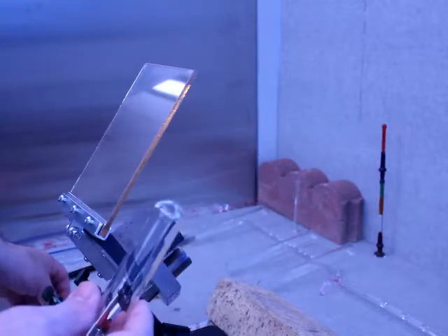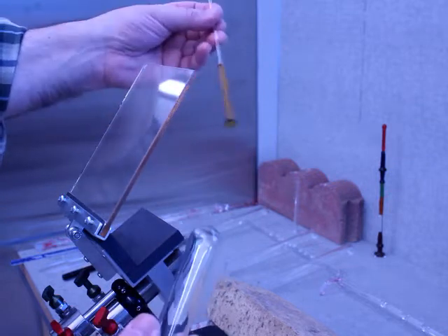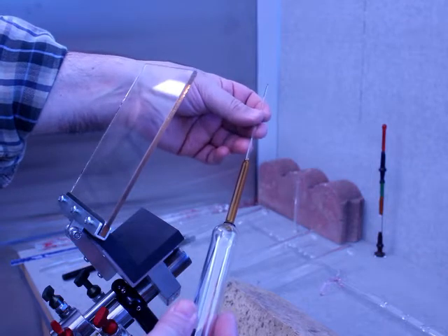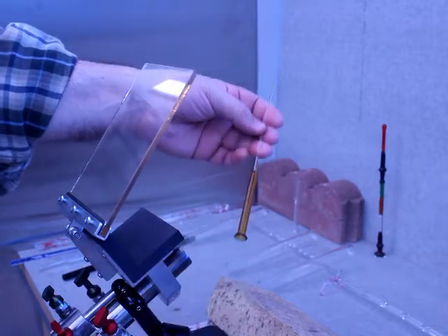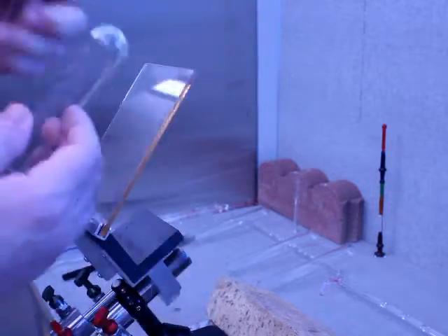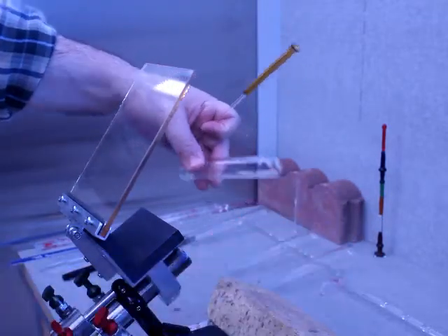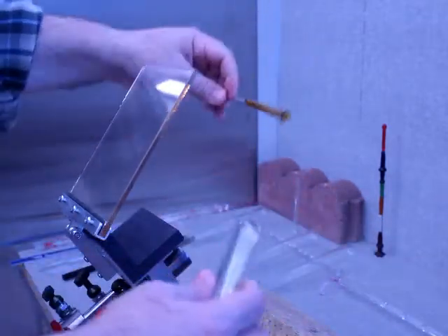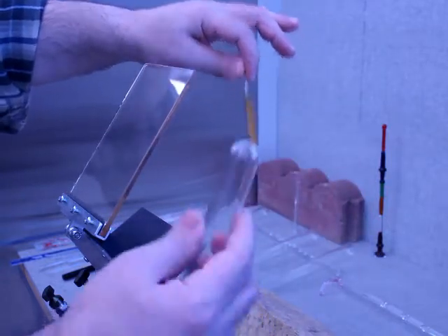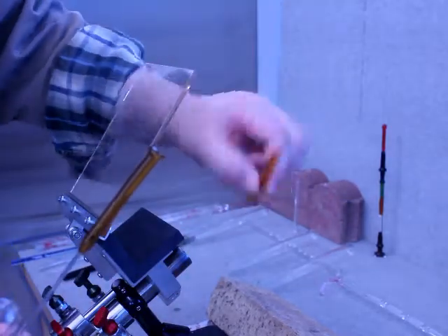Now for this particular demo, instead of doing everything in colorless glass, what I'm going to do now is I'm going to make the inlet for the bubbler with this orange glass, it's borosilicate, so it's not a problem. And the reason why, if I use some colorless glass here, I would be able to see it, but it would be a little bit more difficult for you to see it on the video, and that's kind of the whole purpose of this.